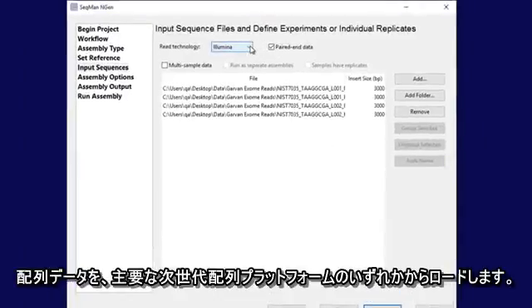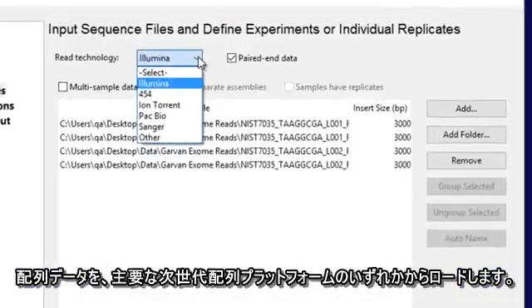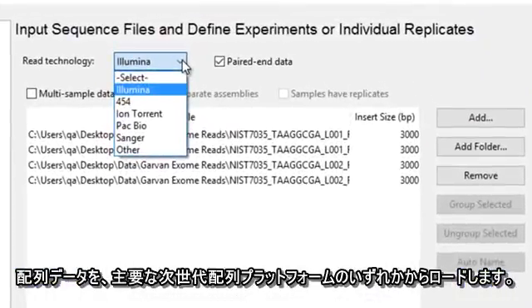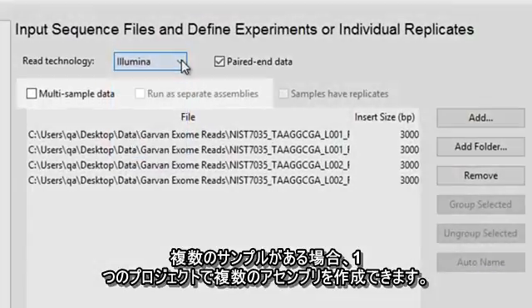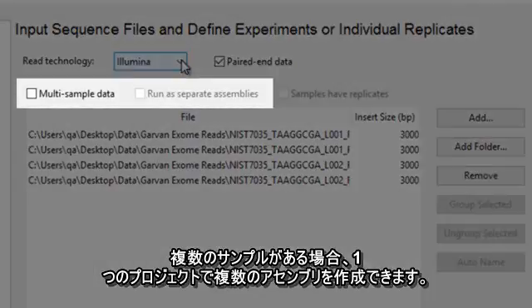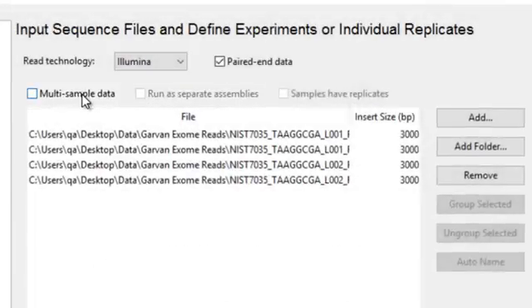Load your sequencing data from any major NextGen sequencing platform. If you have multiple samples, you can create multiple assemblies in a single project.